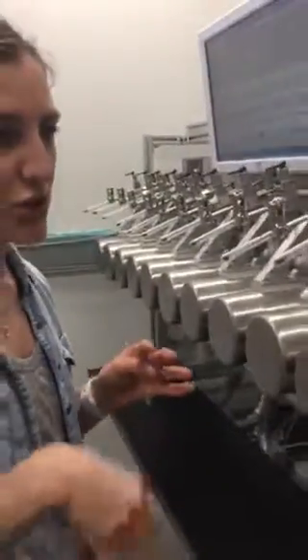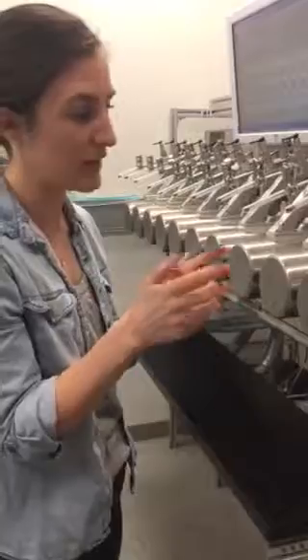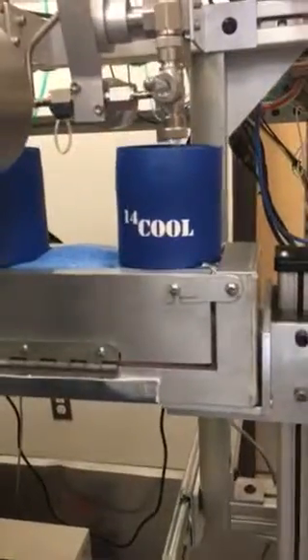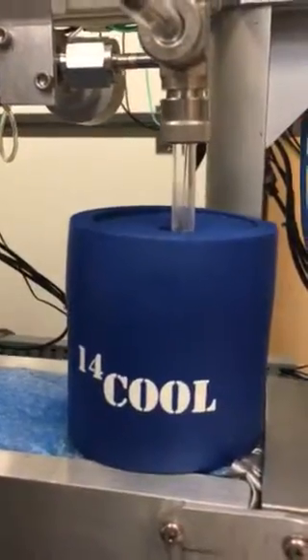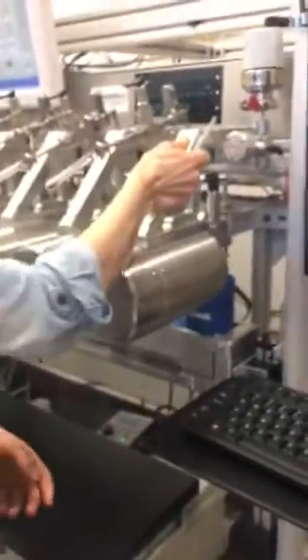The oxygen from the CO2 has turned to water. It's bound with the hydrogen, so now you have H2O. And that water is freezing. There's another tube. If I pull this down just for a quick second, maybe you can see the ice crystals there. See those nice ice crystals? I can't leave it down for too long because we're actually running. So the H2O is freezing and the carbon's adhering to the iron powder.